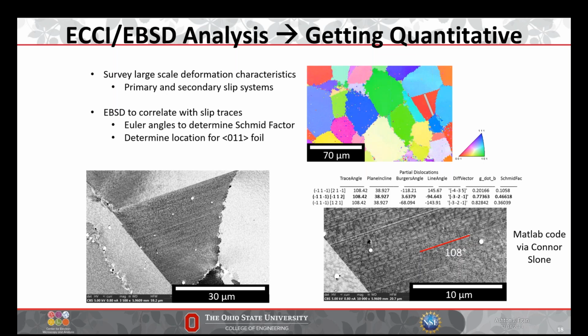If we analyze the microstructure using the HCP phase in EBSD, can we observe SISF and SESF directly?